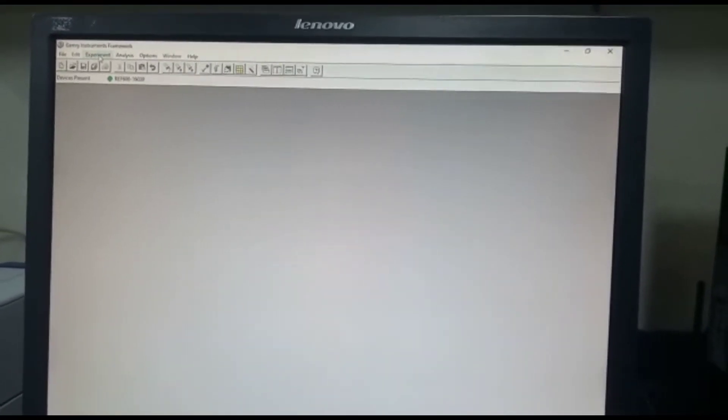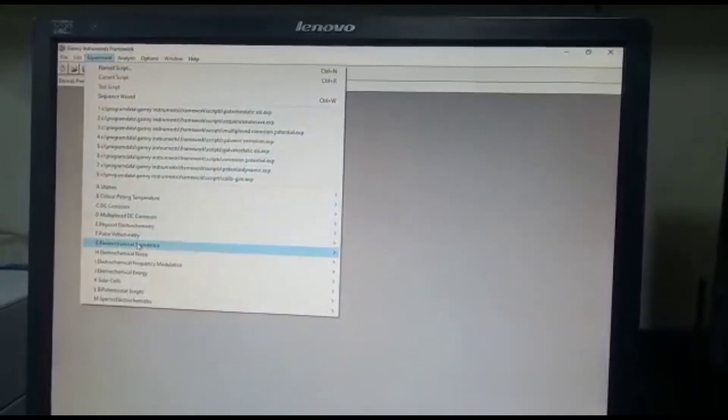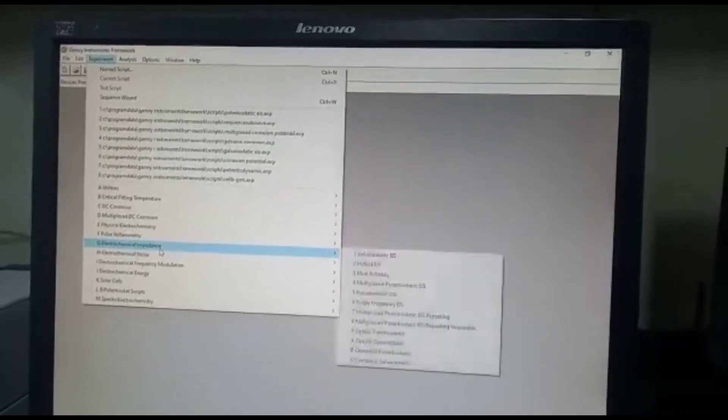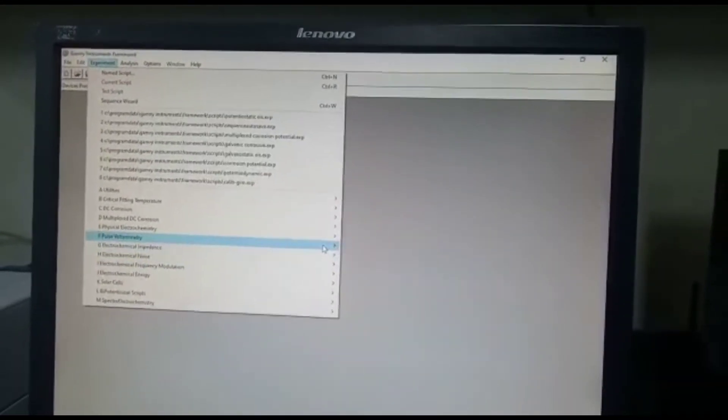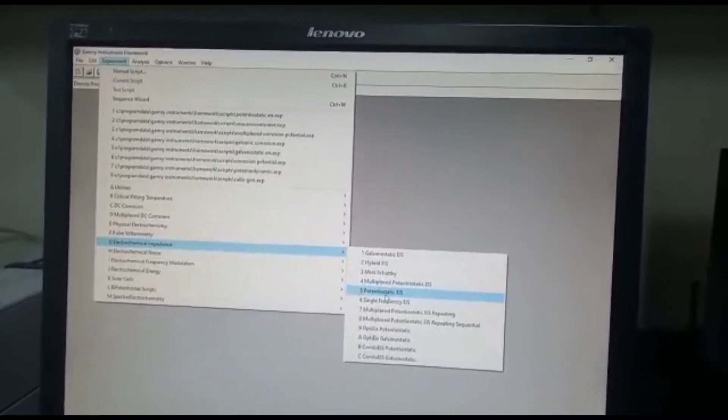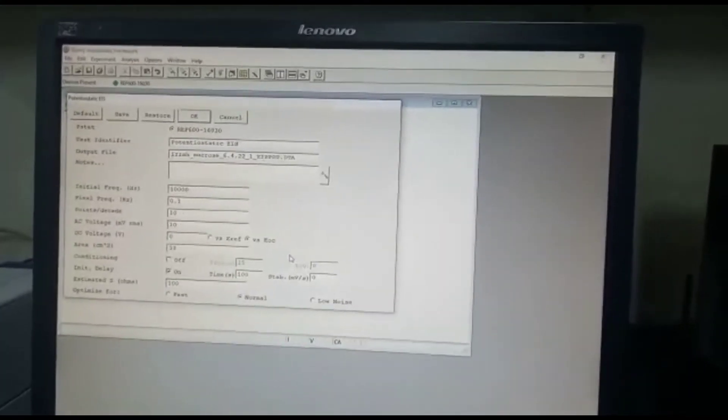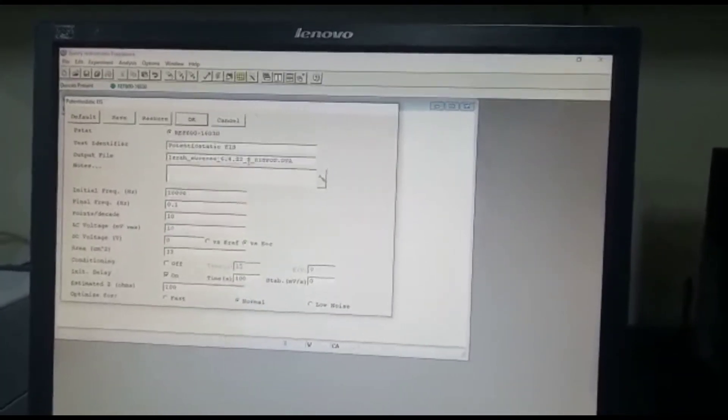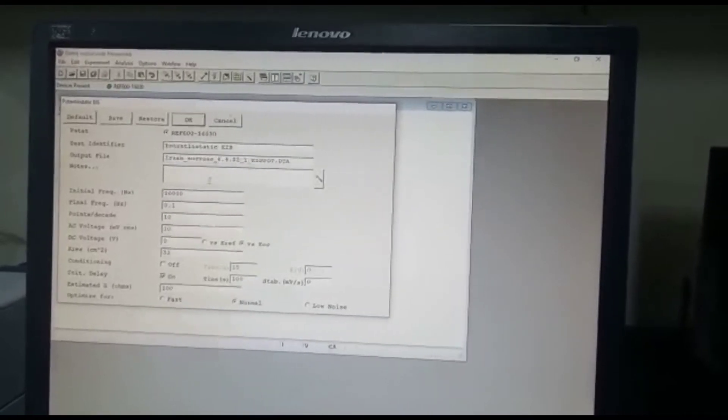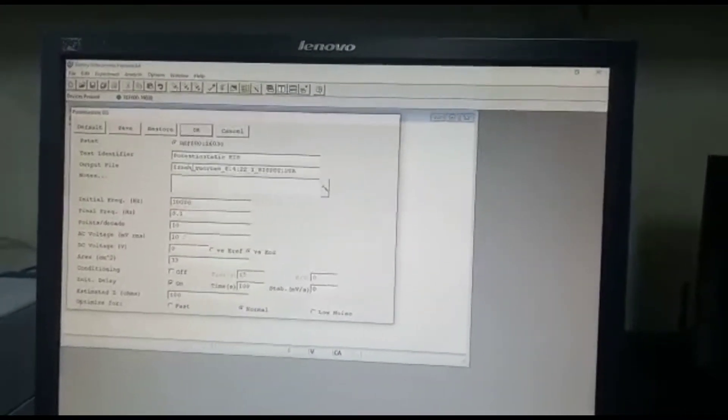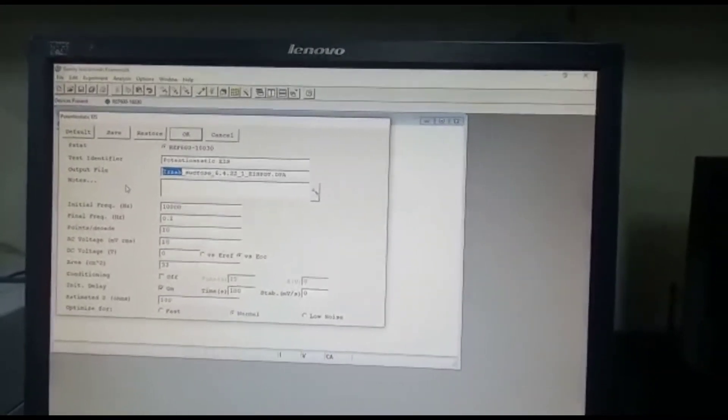And to do Electrochemical Impedance is very simple. So first you just go to Experiment and then you choose Electrochemical Impedance and you choose Potentiostatic EIS. So obviously over here there's a few parameters that you need to change.